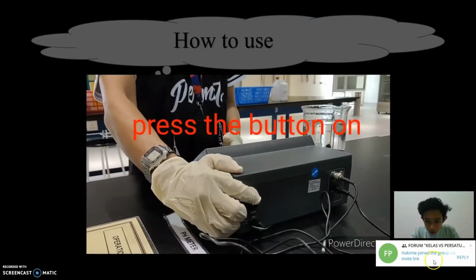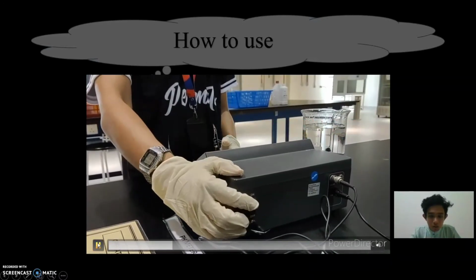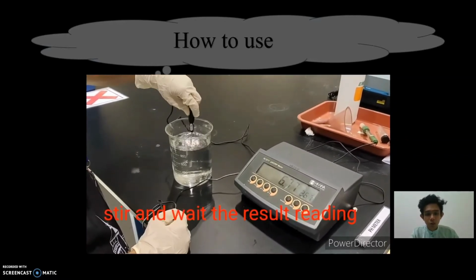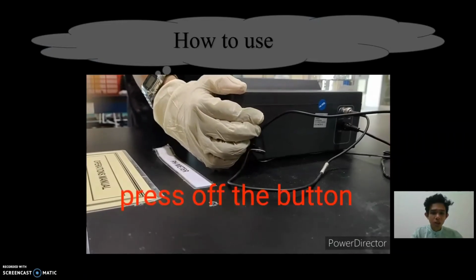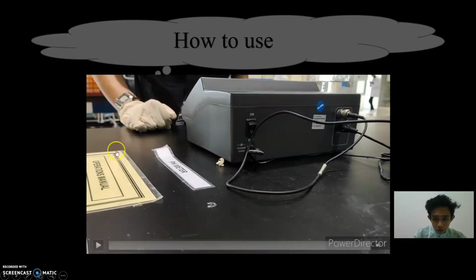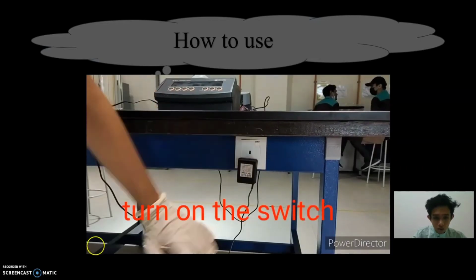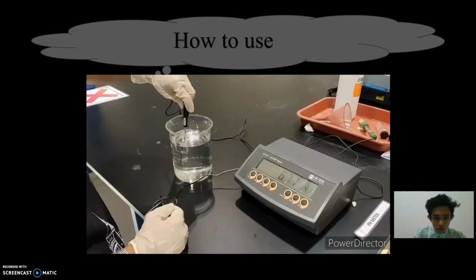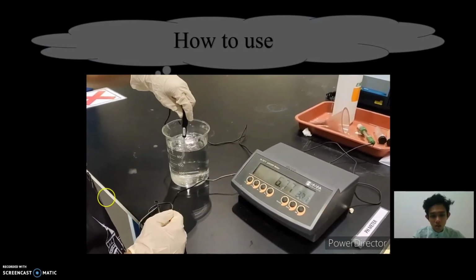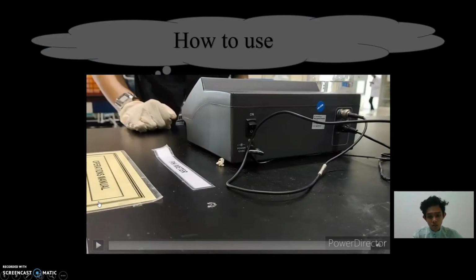First, turn on the switch, press the button on at the back and wait for the result reading. You have to wait maybe 3 or 5 minutes and press off the button before use. Wait for the result reading. Press off the button and turn off the switch.